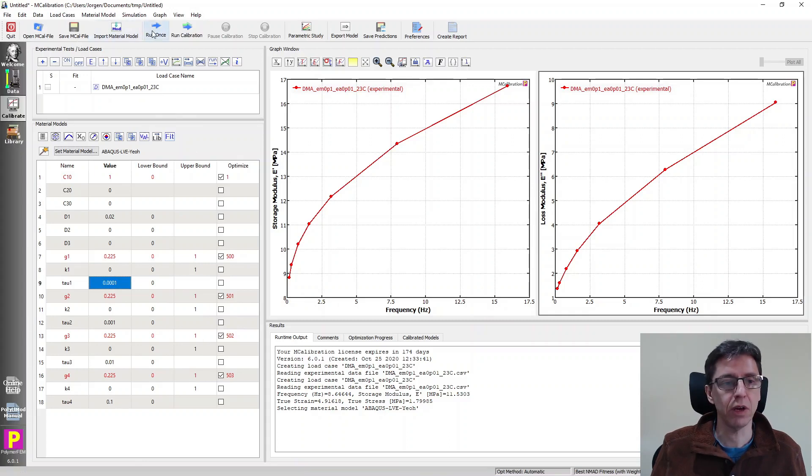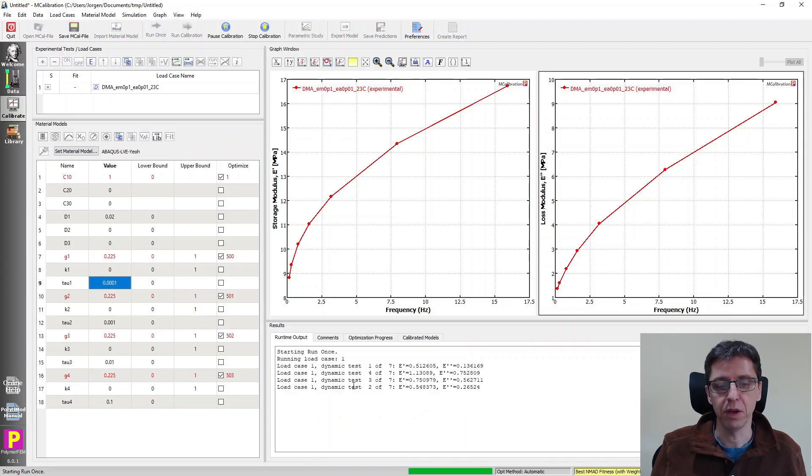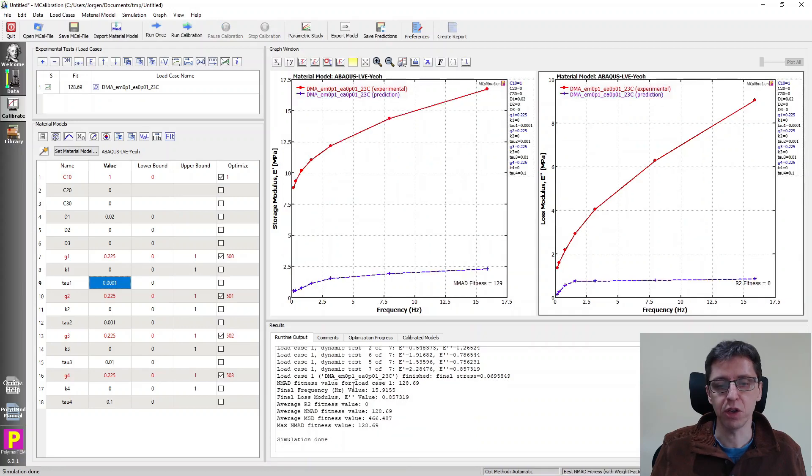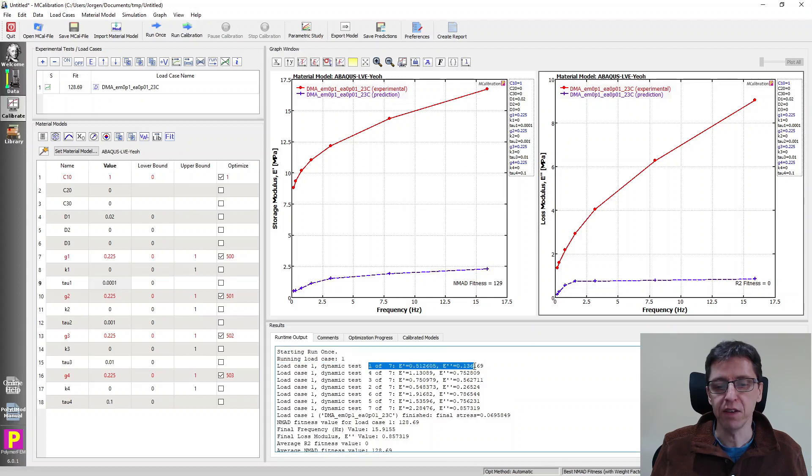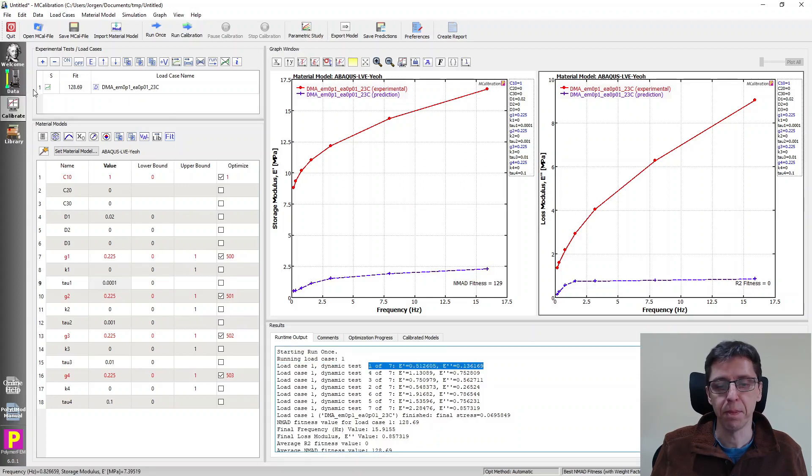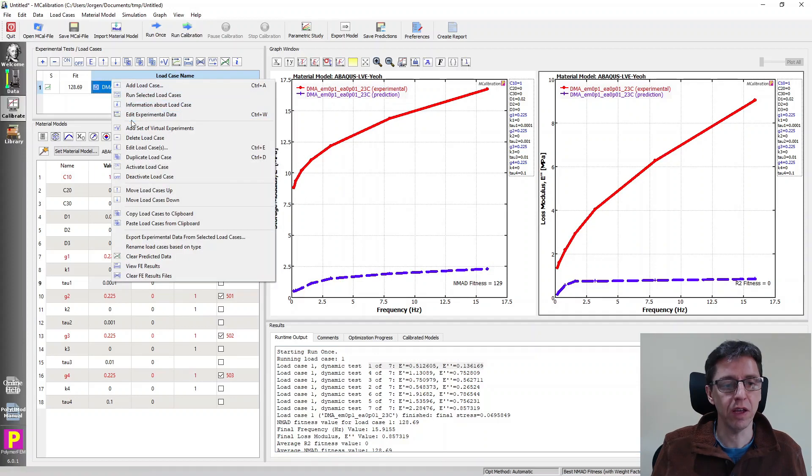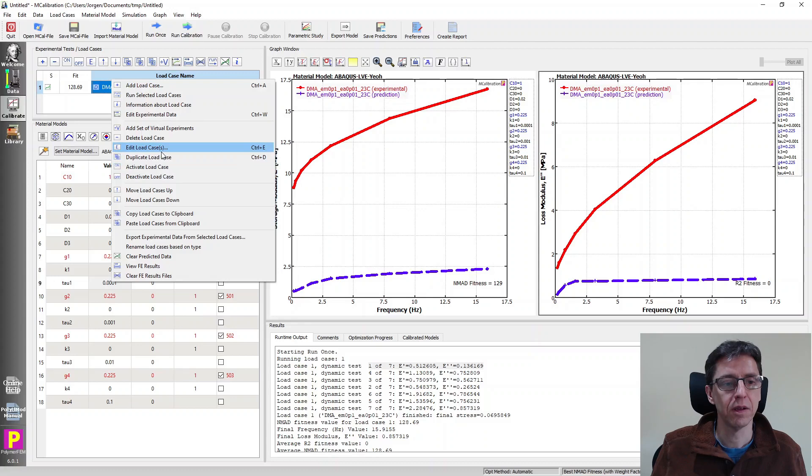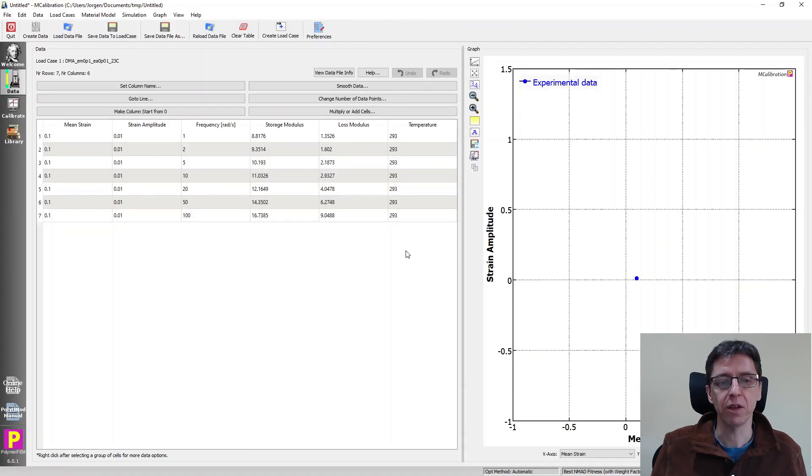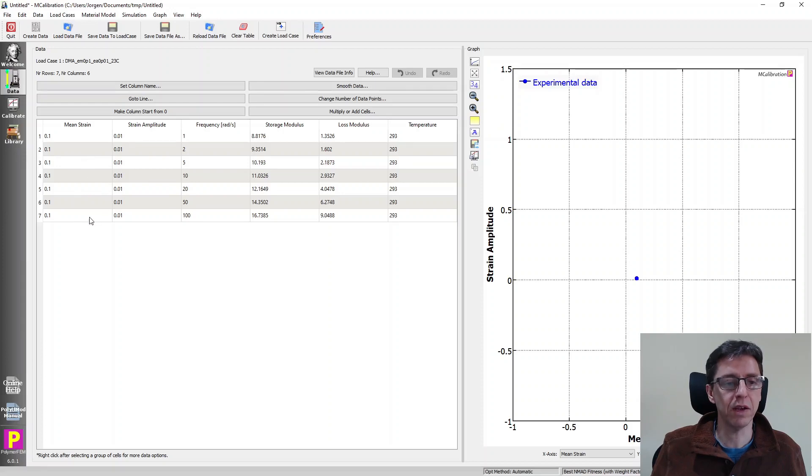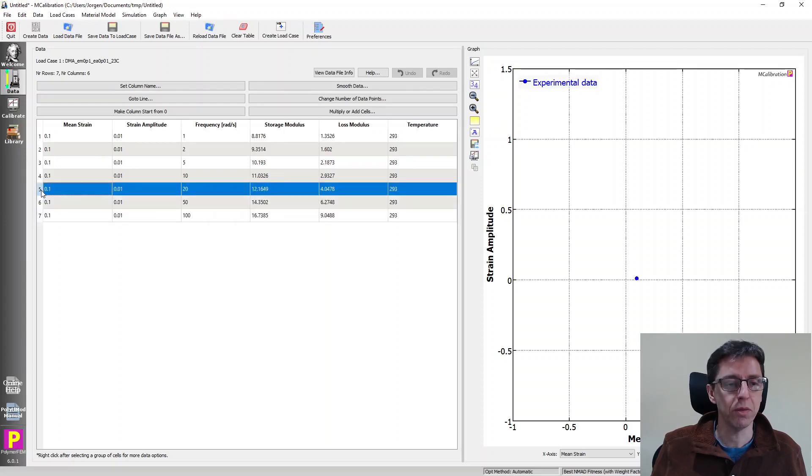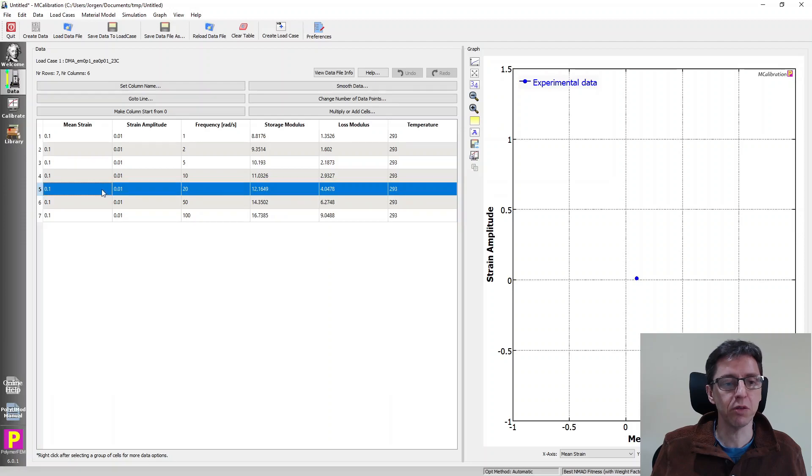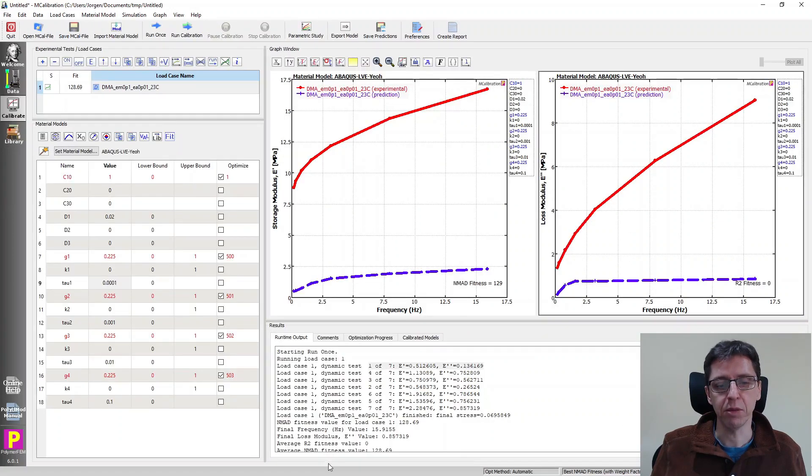I will now click run once. If I click run once, you will see in this window down here that MCalibration prints one line for each data point in your DMA file. So if I go back to this, I right click on this and I say edit experimental data. This one, we can bring over the data and we can look at it. We have these seven rows of data and there's basically one data point for each row.